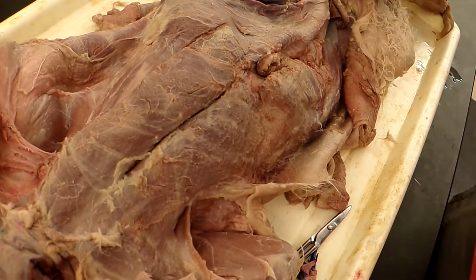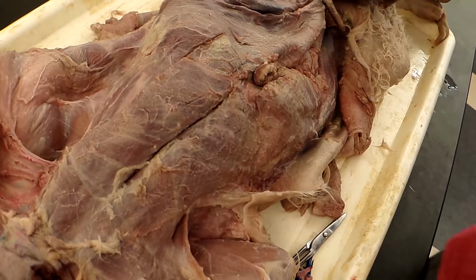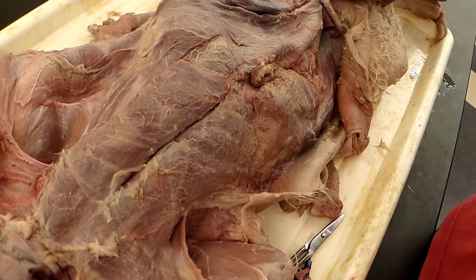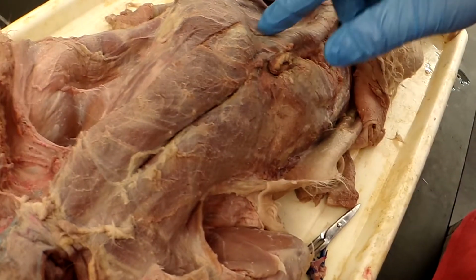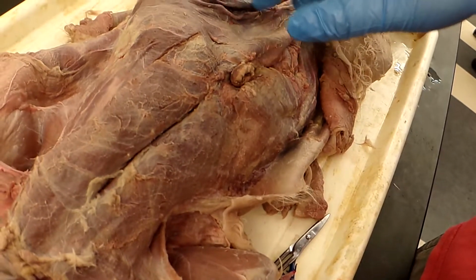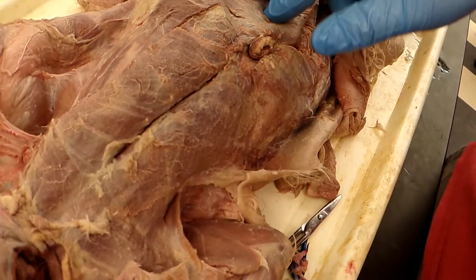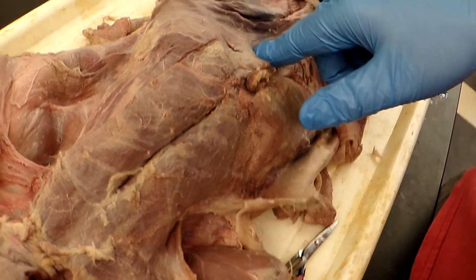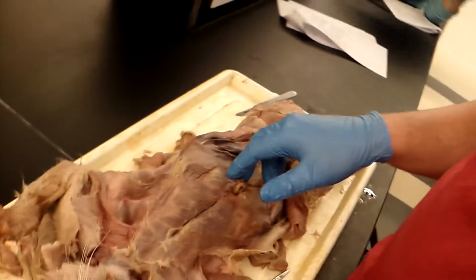Moving on to the deep thoracic musculature, we have the serratus ventralis, which is located also under here, right by the rectus abdominis. Its origin is the cervical vertebrae and the ribs. The insertion is the scapula, and the function is to support the scapula.